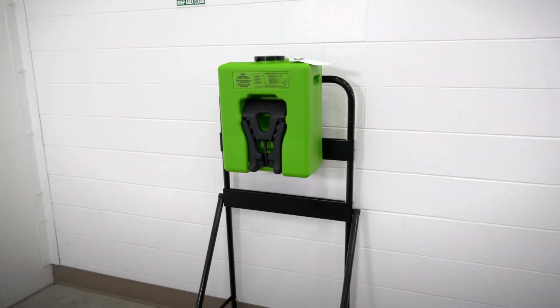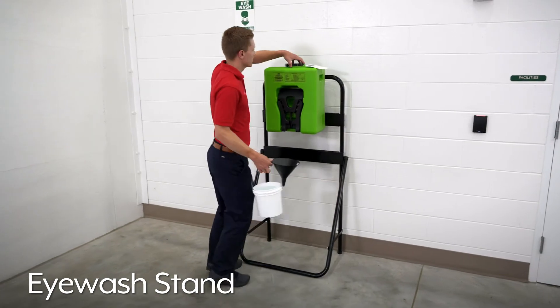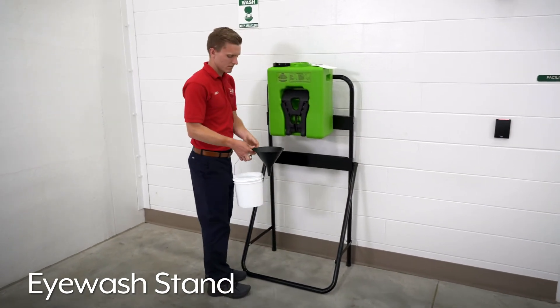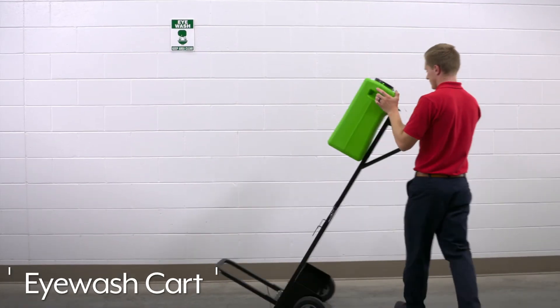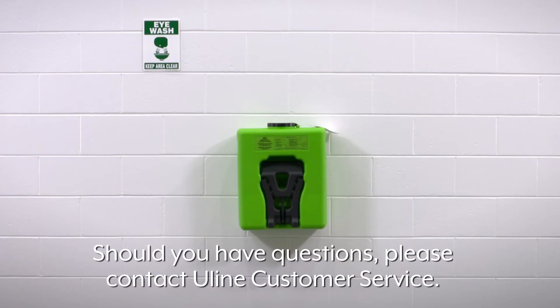If wall mounting is not desired, the versatile Slim Flow Eyewash Station can also be mounted to Uline's eyewash stand or Uline's eyewash cart when mobility is required. Should you have questions, please contact Uline customer service.